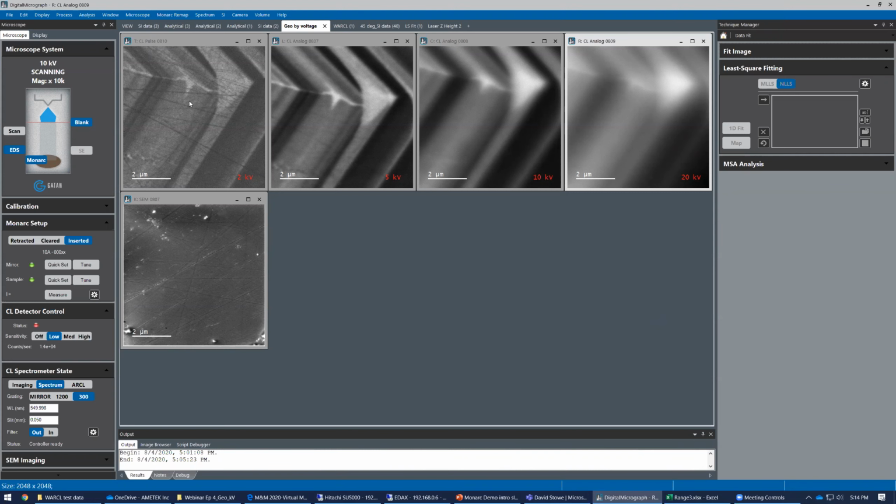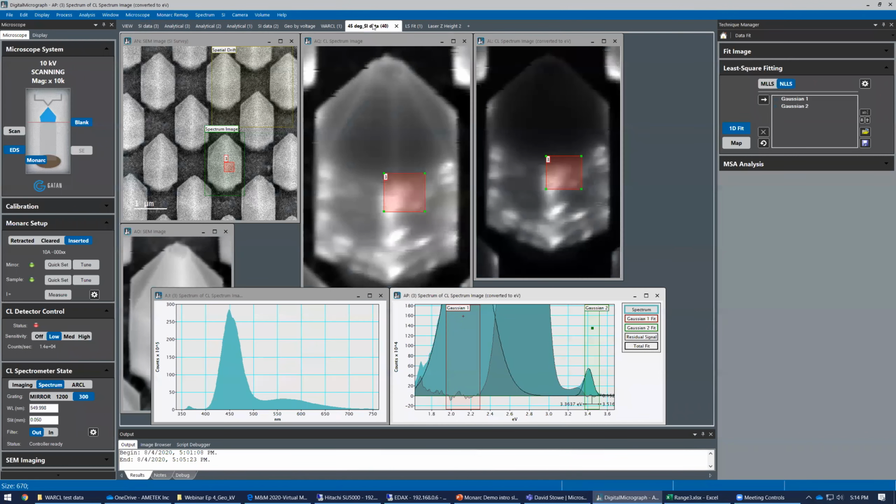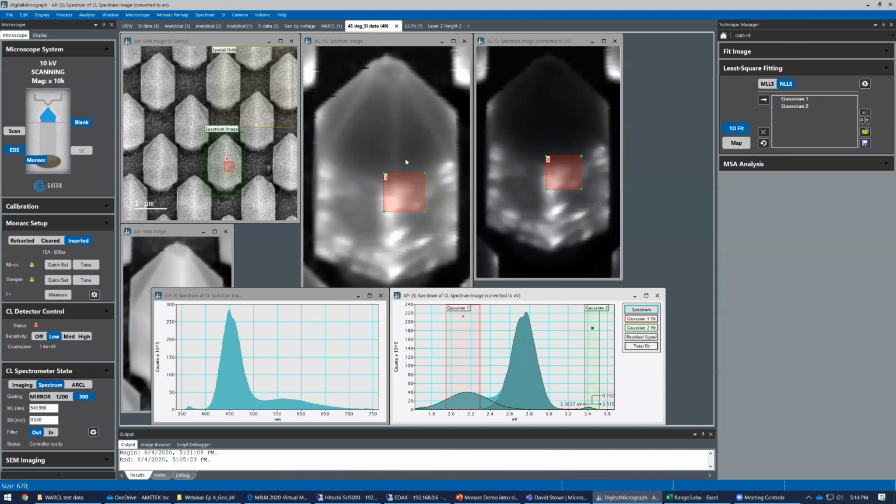If you don't mind, another verbal question. Absolutely. When you had the gallium nitride sample up there, you mentioned, or wait, I'm not sure it was the gallium nitride, it's probably the one after that. But anyway, you mentioned that some of the signal is coming from plasmonic effects. Is that actually telling you anything about the sample itself, or more about the geometry of its structure at some level? I'm trying to understand to what degree it's really telling me things inherently about the material itself.